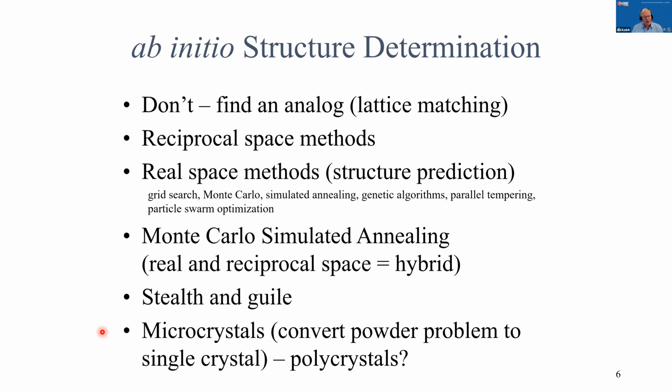How one mounts and centers such a thing is an interesting concept, but you can also imagine looking at a small assembly of such crystals, polycrystals. And the idea would be to essentially collect the data set from each individual crystal in your specimen, and then merge all those together into one single crystal data set and solve the structure that way. You might end up getting a better refinement by the Rietveld technique using the powder data, but getting the initial model might be something to consider doing it this way. This is talked about more often than it's actually done, but it's something to keep our eyes on.